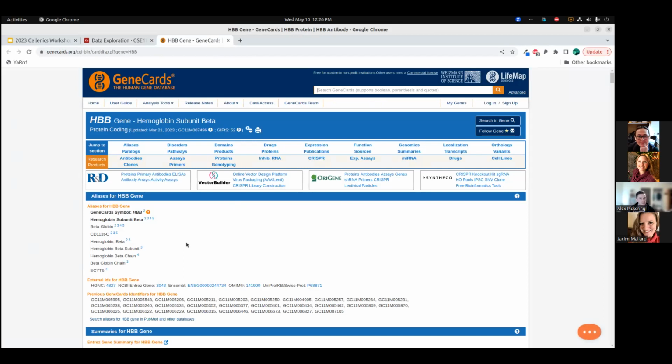I don't believe it will. I think GeneCards is very human centric. I think it probably still will go to the right place if it's mouse or rat. They usually use the same gene identifiers. They're just title case instead of all caps. So they'll still give you the information for that, but you might have variable luck for other species.